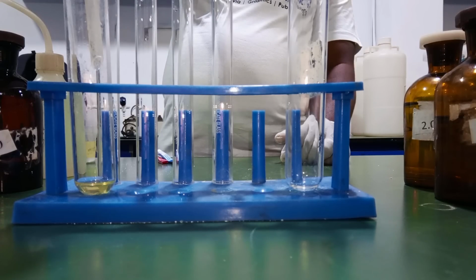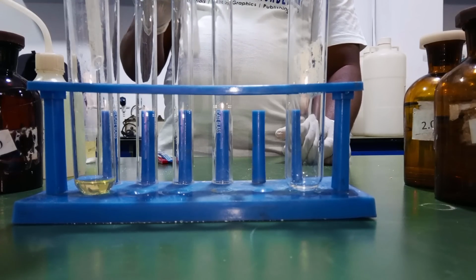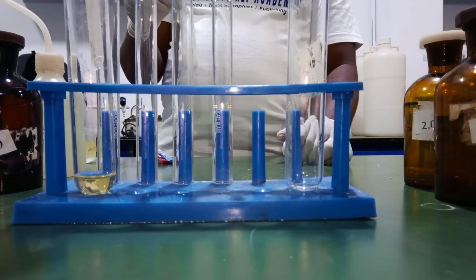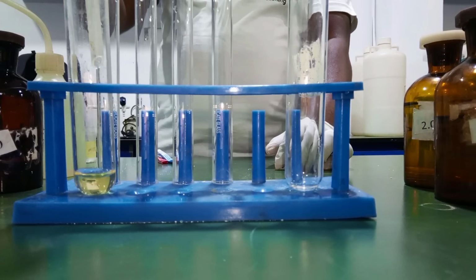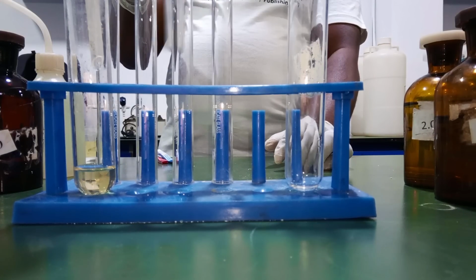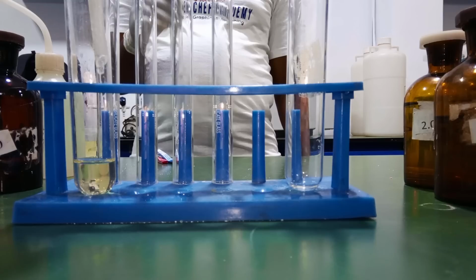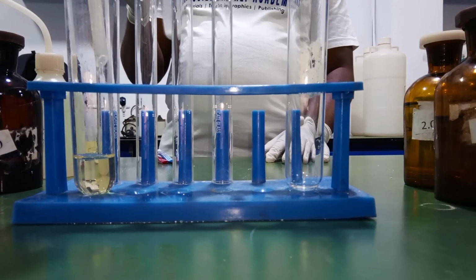This will take some time. So while the filtration is going on, you can be working on your question 3. Please, when you're pouring into the filter paper, ensure that it does not spill into the filter funnel so it does not interfere with the filtrate. You can see the clear filtrate that we are getting, and that is sodium trioxonitrate(V) that we spoke about in the first part of this tutorial. This is a slow process, so it will take a bit of time.